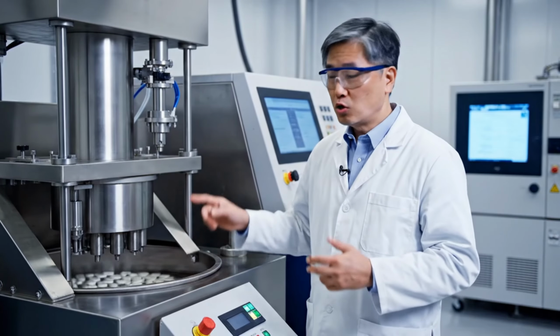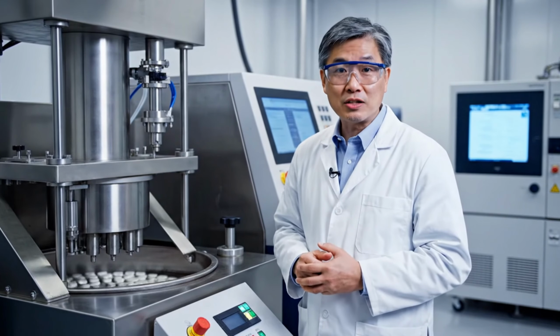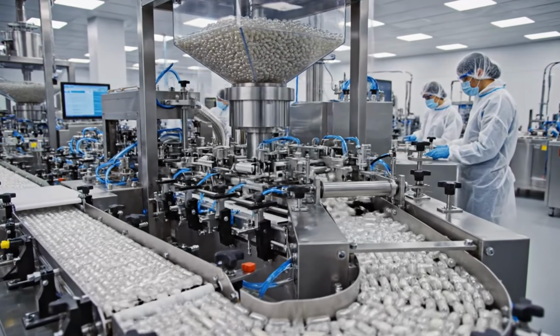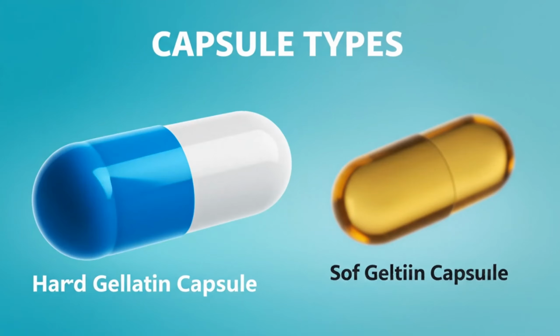Coating sounds simple, you spray liquid onto tablets. But in reality, you are managing inlet air temperature, exhaust temperature, spray. While the tablet line handles compressed solid doses, another section of the facility is dedicated to capsule manufacturing.